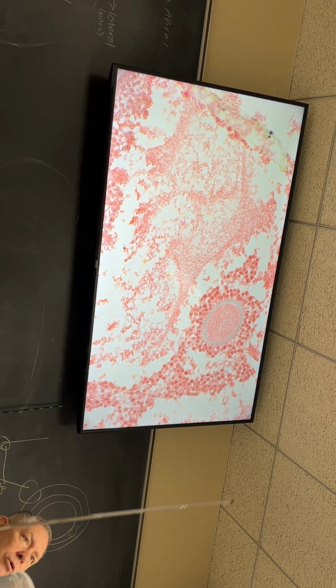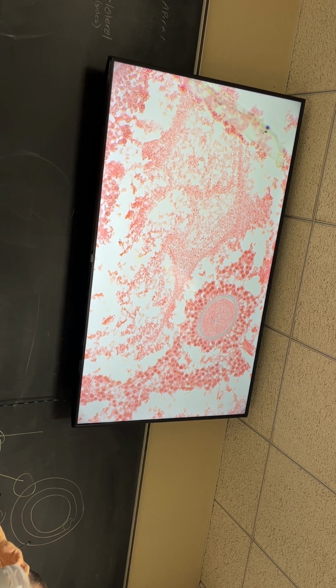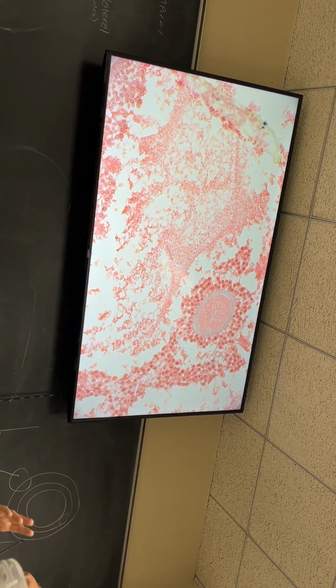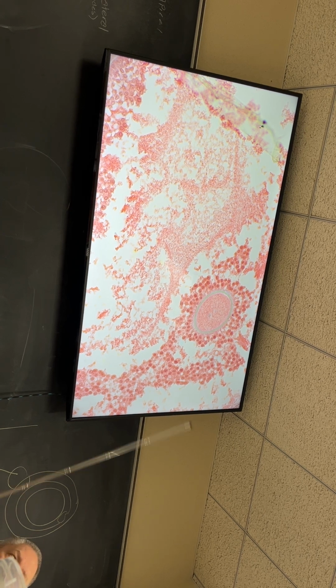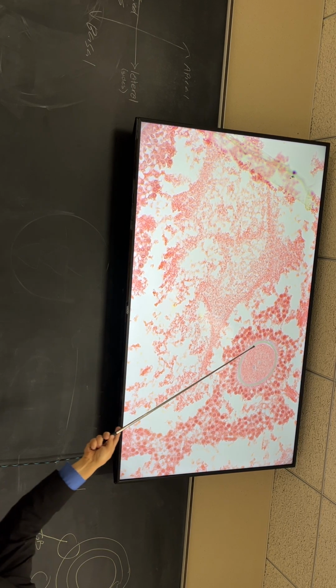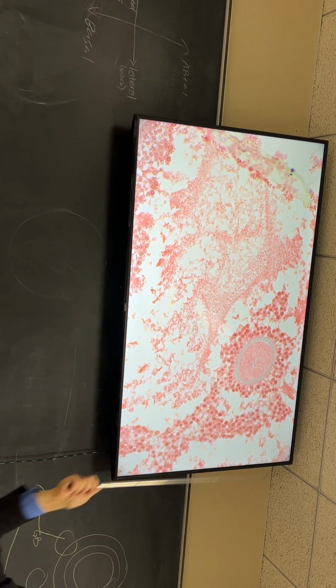Think about that. Corona, ring, radiation out, right? And then the other one, cumulus, complete, oo, egg, phorus, bearing, right? Complete egg bearing. So they both almost kind of mean the same thing, right? It's kind of weird, right? The words aren't different, but obviously one of those is the blue ring around, and the other one is this ring of cells that are connected to that blue ring, right?